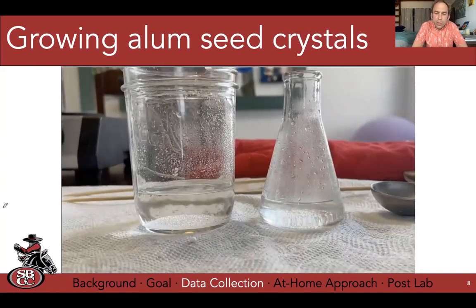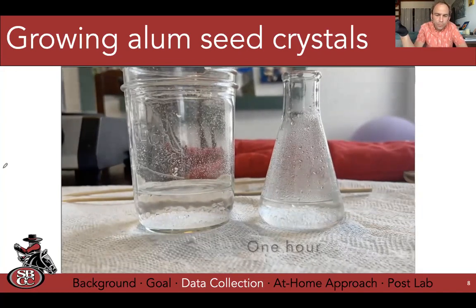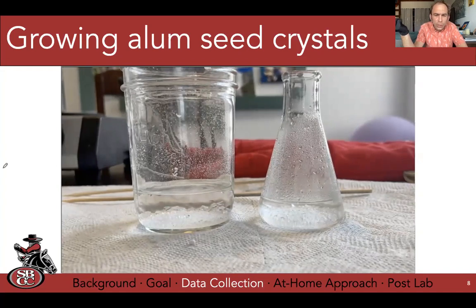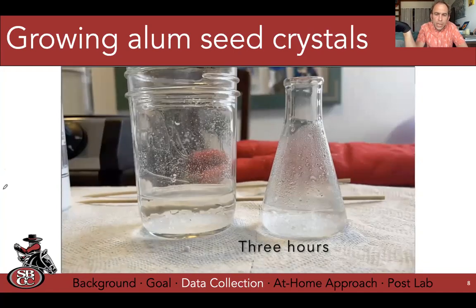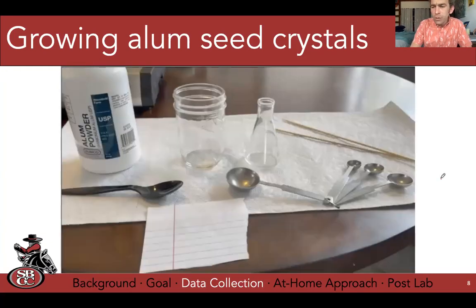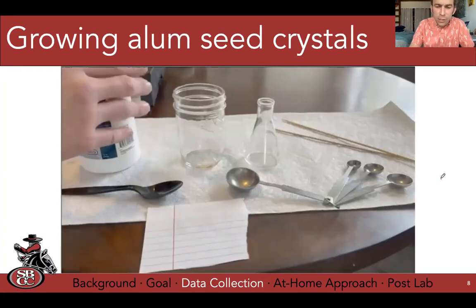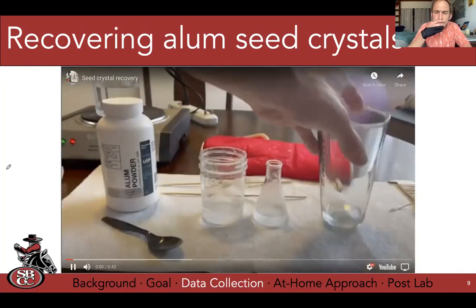So now we're going to see the crystals grow. This is happening. You'll see timestamps. This is after 1 hour. You're asked to wait 3 to 4 hours. And then here's 2 hours. And so you can see some pretty constant growth, and 3 hours. And my argument is right around 3 to 4 hours, there's no benefit to waiting much longer. So I think after 3 or 4 hours, you're going to get your seed crystals. And then this is just what they look like afterwards, really quick.